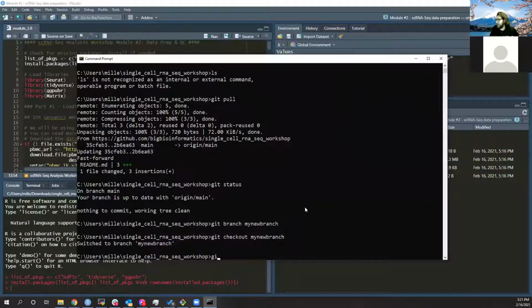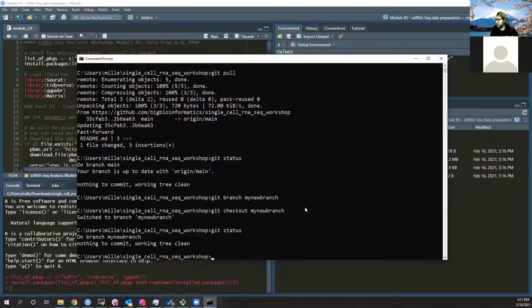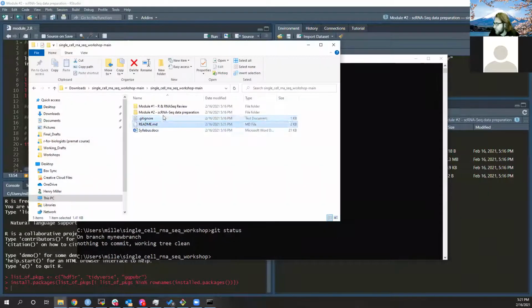So let's go ahead and do git status now. So I've made a change. Okay, well, apparently I made that change in the main branch. So apparently Notepad does not track that. My bad. Anyways, this is not supposed to be a Git tutorial, so I'm not going to go any further on this. I guess it would be more of if you added a new file.